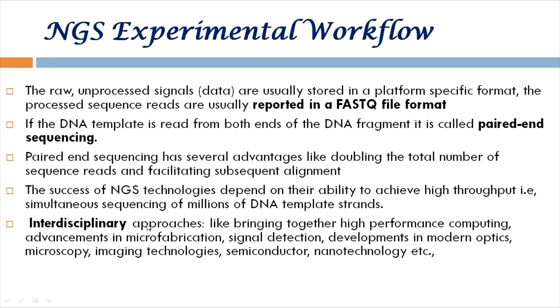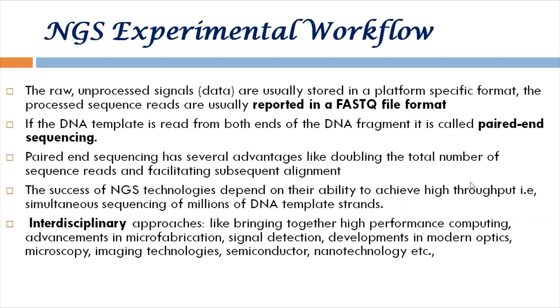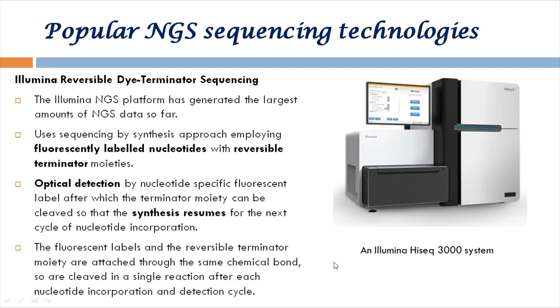And as I told you before, NGS is an interdisciplinary approach. It brings together high performance computing advancement that is necessary, because, as I told you, there are millions of fragments here, and so you are going to have millions of strings that have to be put together to reconstruct the entire genome. Apart from that, there are several statistics that have to be done to understand the quality, so there is a very high demand for high performance computing. And then advancements in microfabrication, as I told you before, because you have to develop the platform, signal detection, optics, microscopy, imaging techniques, semiconductor, nanotechnology, etc. Before going further, we'll see some of the popular NGS sequencing technologies that are available.